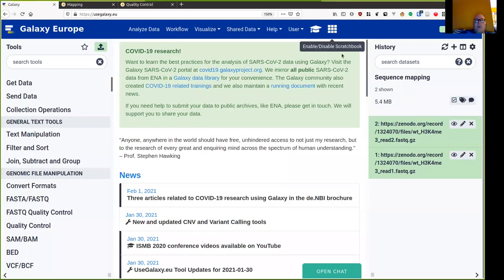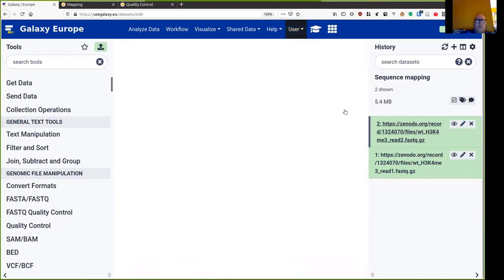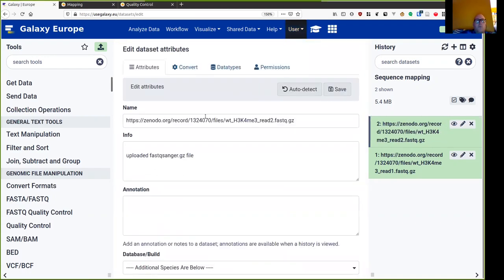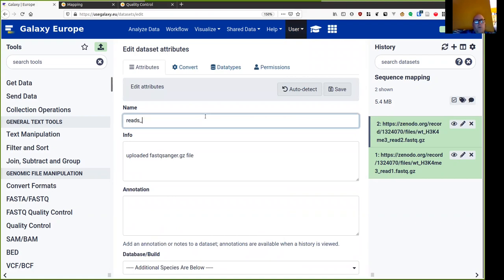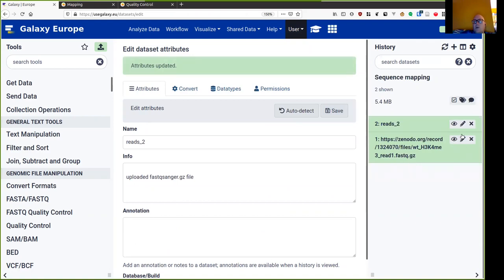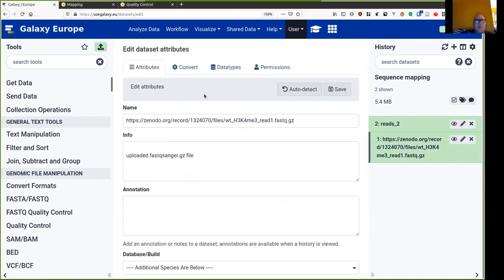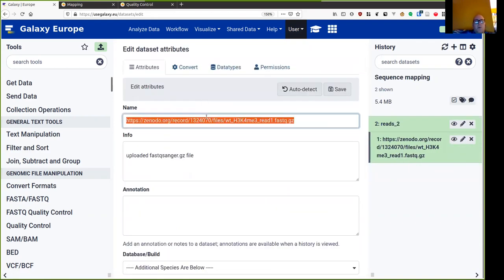Now that my data is ready in Galaxy, the first thing that I want to do is give my datasets more meaningful names. So we see here they have long names. I'm just going to call this reads2, save it, and I'm going to call this reads1.